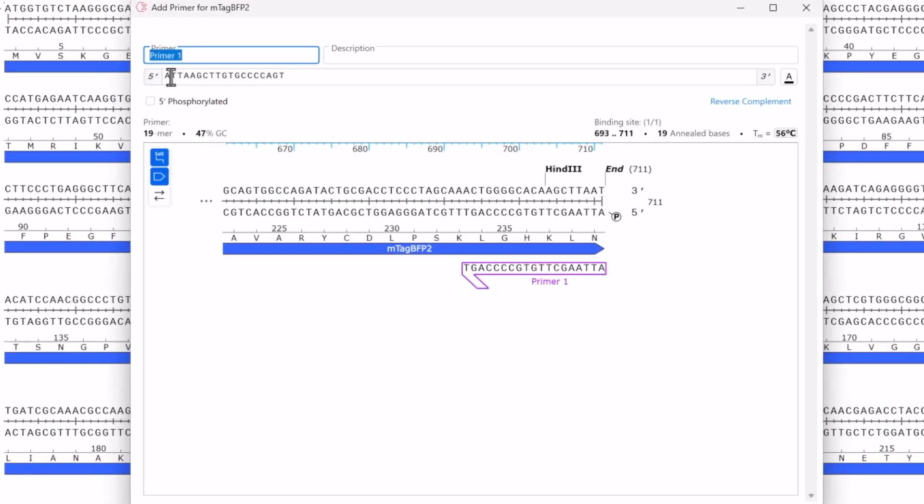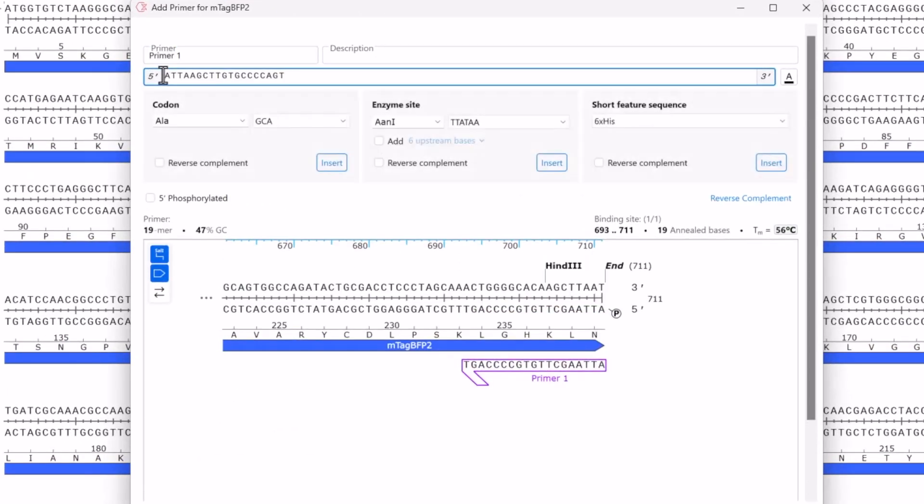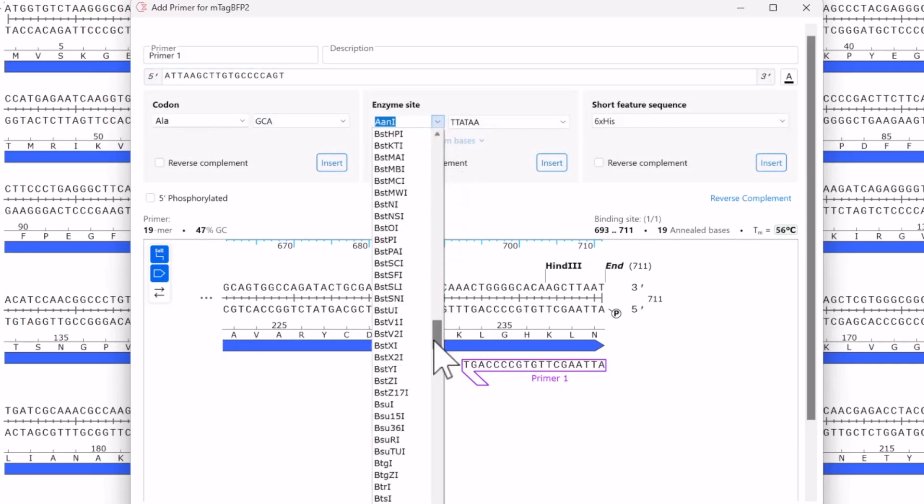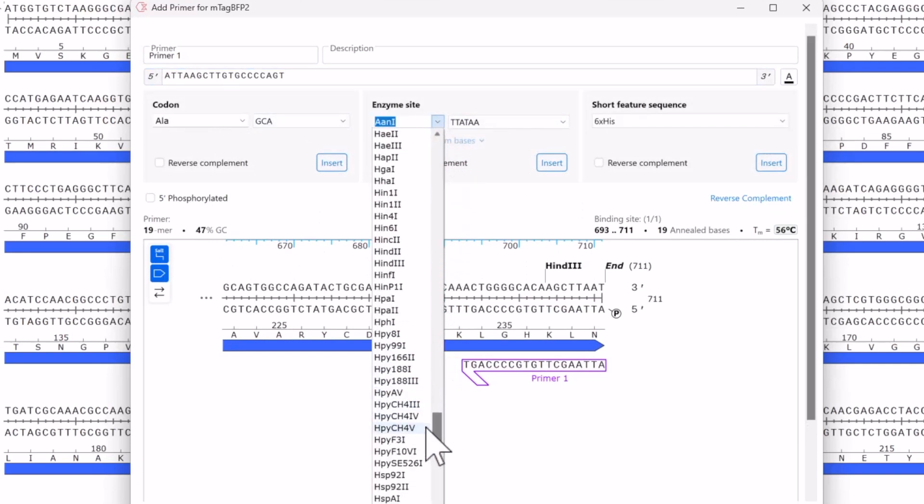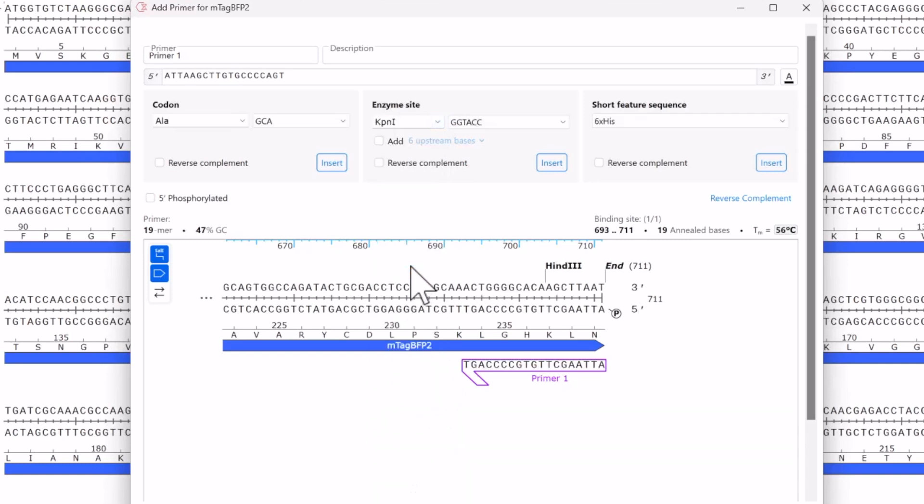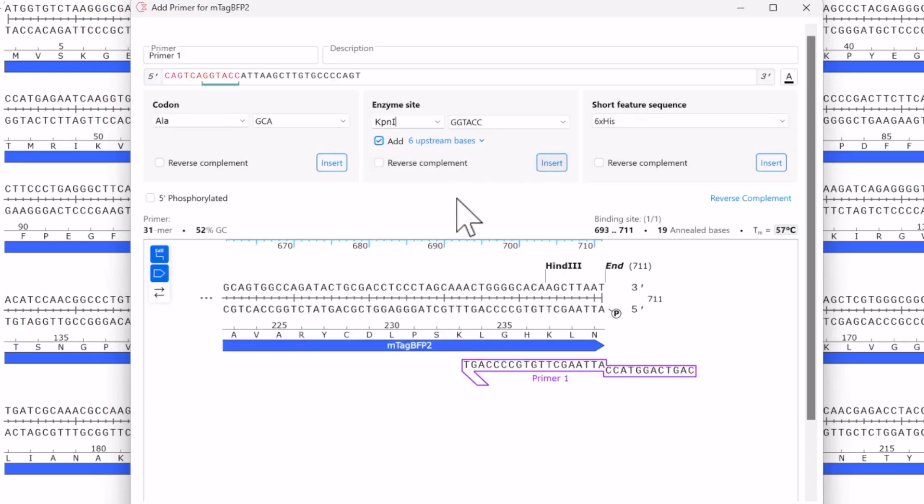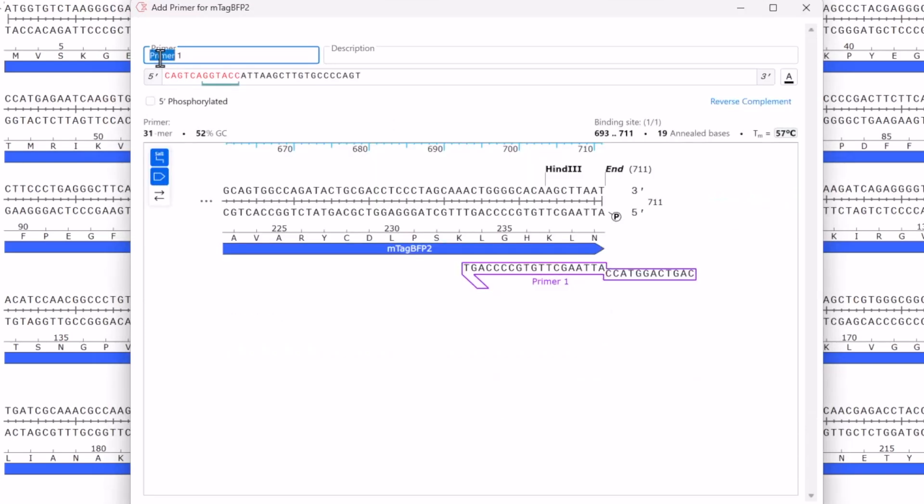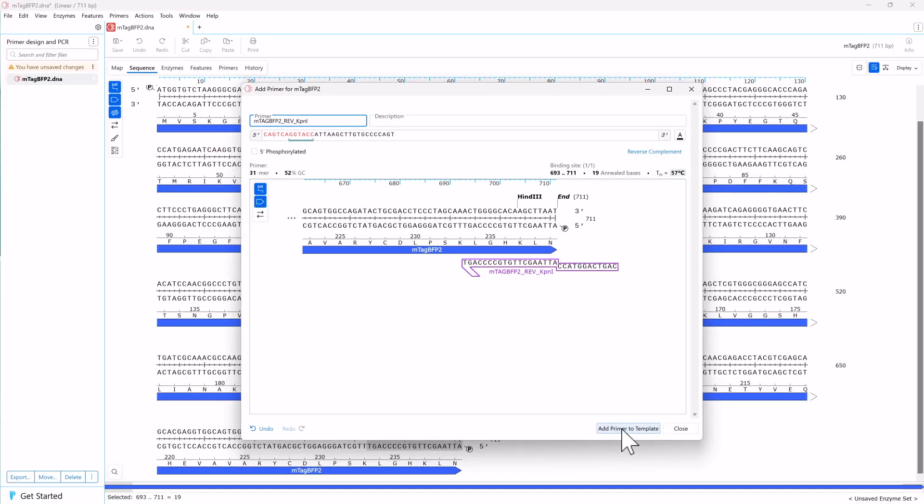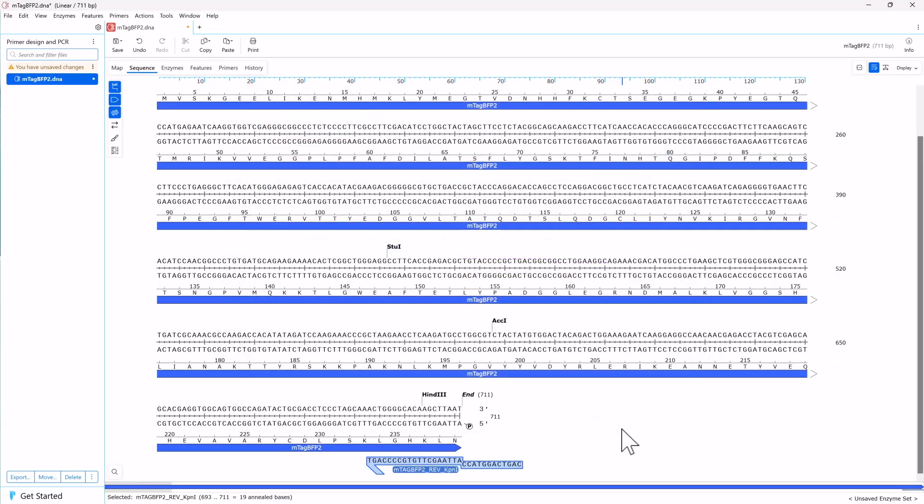For the reverse primer, add a KpnI site to the five prime end and add extra bases. Then give the primer a name and click Add Primer to Template to create your reverse primer.